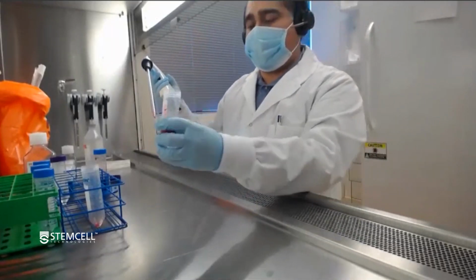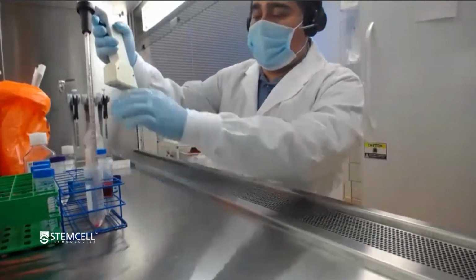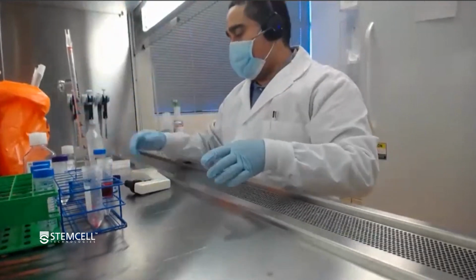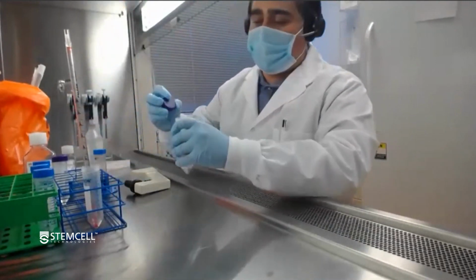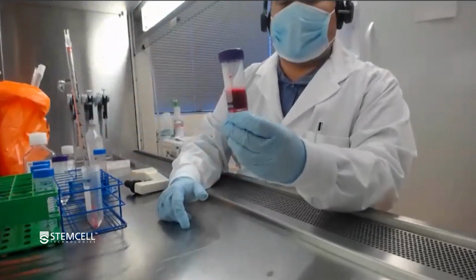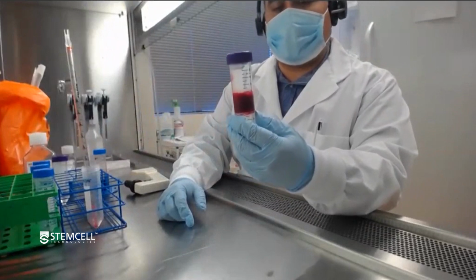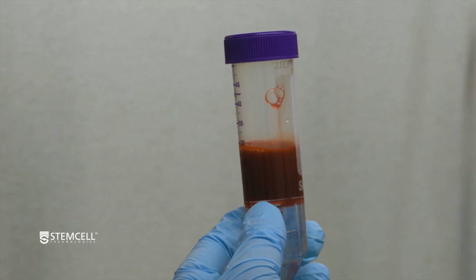Now that it's dispensed, all you have to do is cap the tube and do a density centrifugation. In this case, this blood was harvested about 24 hours ago, so it will be a 1200 times G spin with the brake on for 20 minutes.